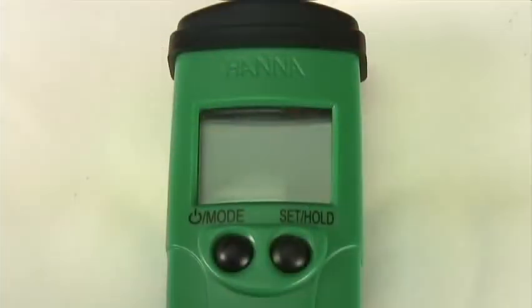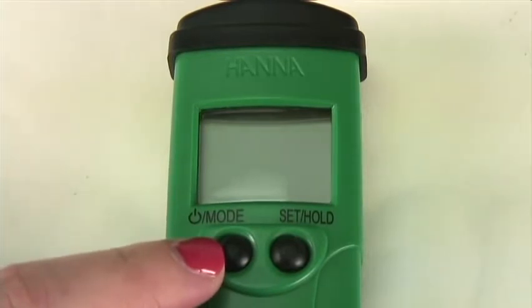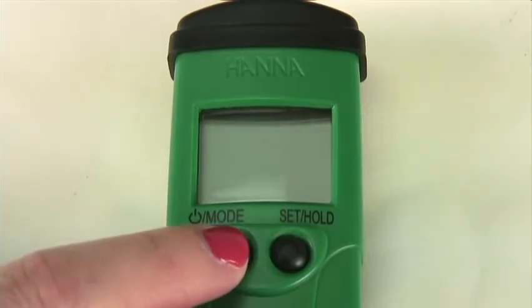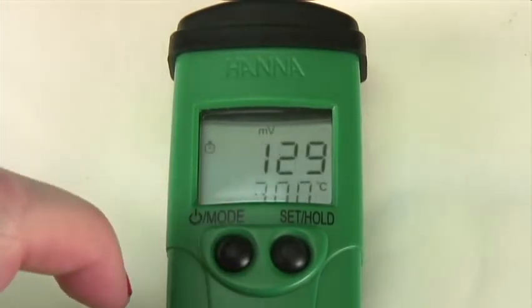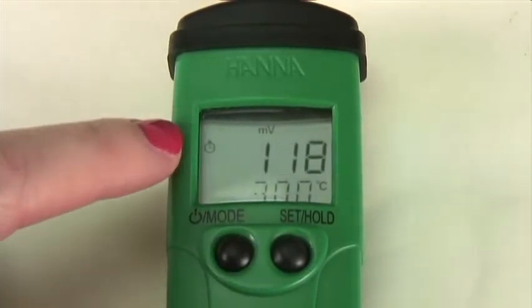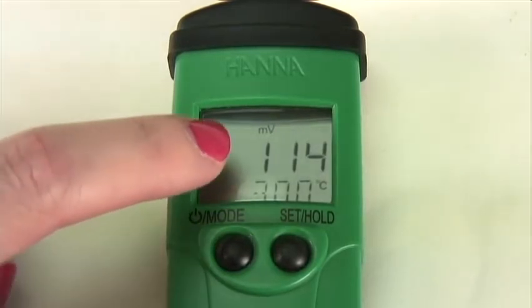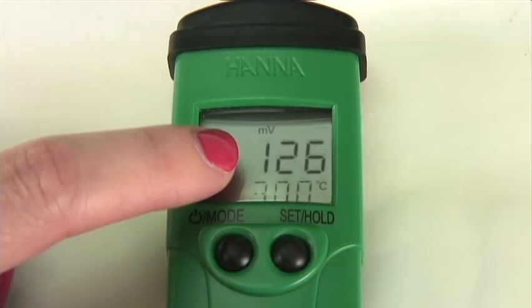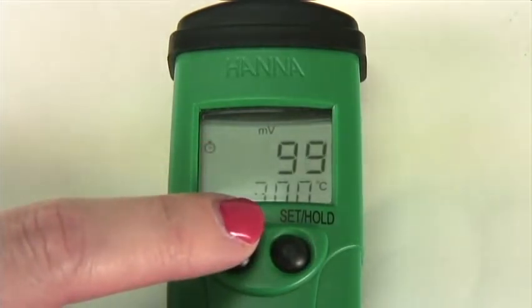To turn the meter on, simply press and hold the power mode button on the left hand side of the meter. The first number that will appear is your battery percent level. Once that disappears, you will see the stability indicator in the shape of a clock, which will disappear once the reading is stable. Then you'll see the ORP reading in millivolts and the temperature in degrees Celsius.